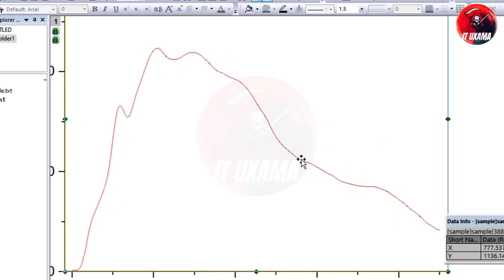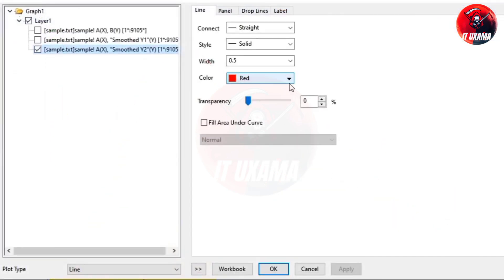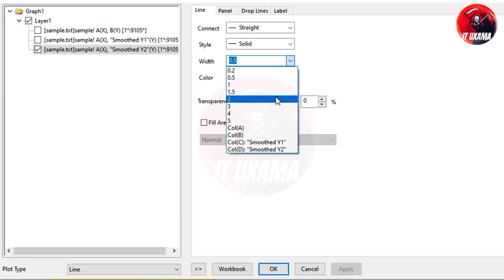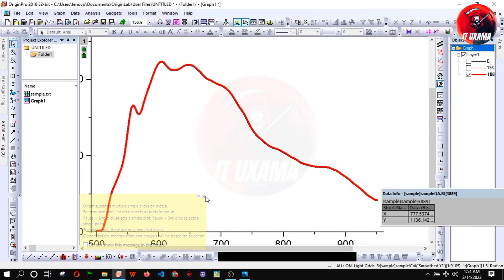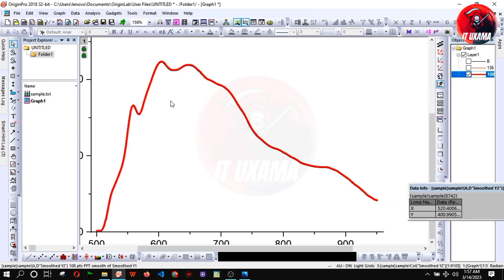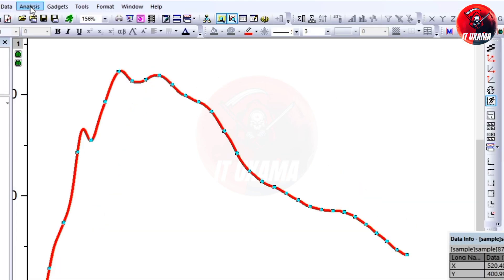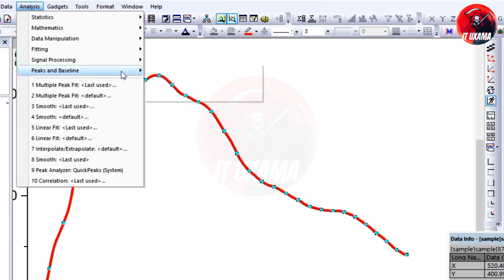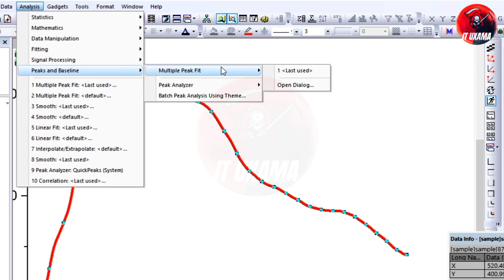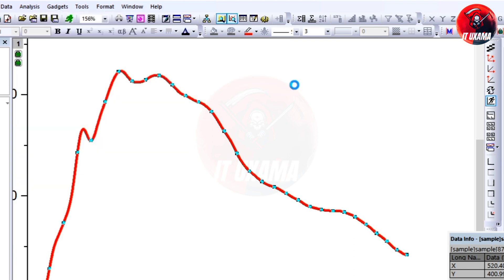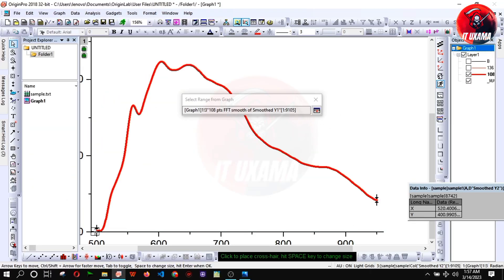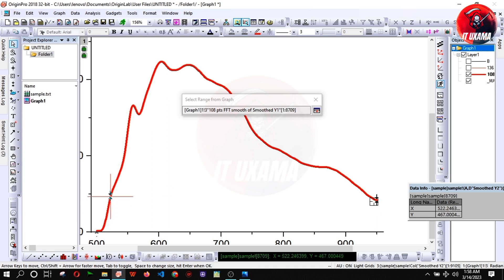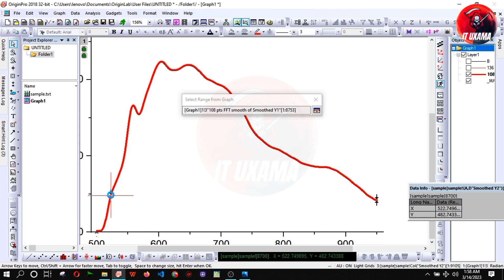Double click on the FFT fitted curve and increase width to three. Now we will deconvolute curve. For that go to analysis, peaks and baseline, multiple peak fit, open dialogue. Now select the range of data you want to deconvolute. Remember that the y-axis data should start and end up at a same value. Here around 400 to 420.